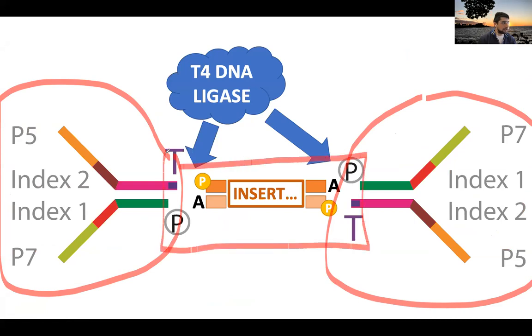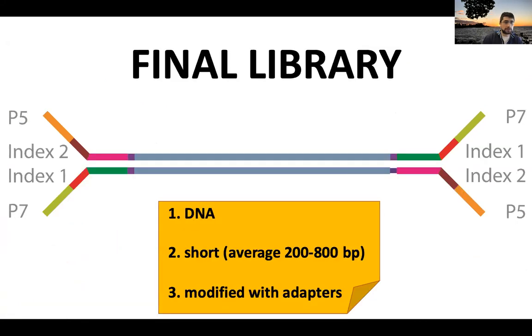Now everything is ready for the T4 DNA ligase. That's the enzyme that we're using to attach the adapters, to basically seal everything together. Now we have our final library.